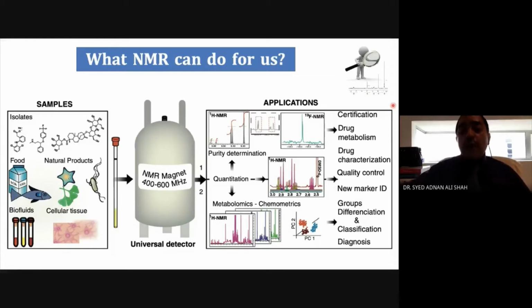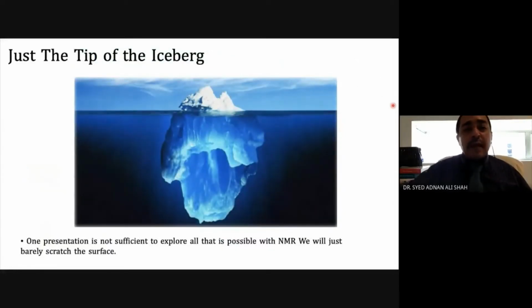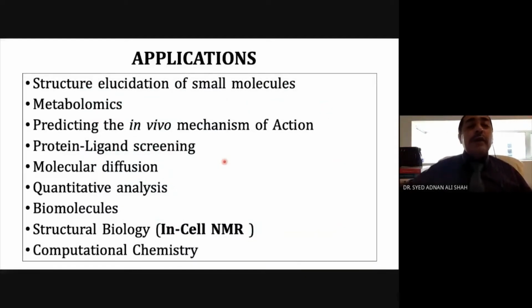Later on, I will go one by one and show you some of the fascinating roles of this instrument. I will only be on the tip of the iceberg. I will not go into the detail because one talk or presentation is not enough to understand this topic. So I will just cover all the applications of nuclear magnetic resonance spectroscopy.